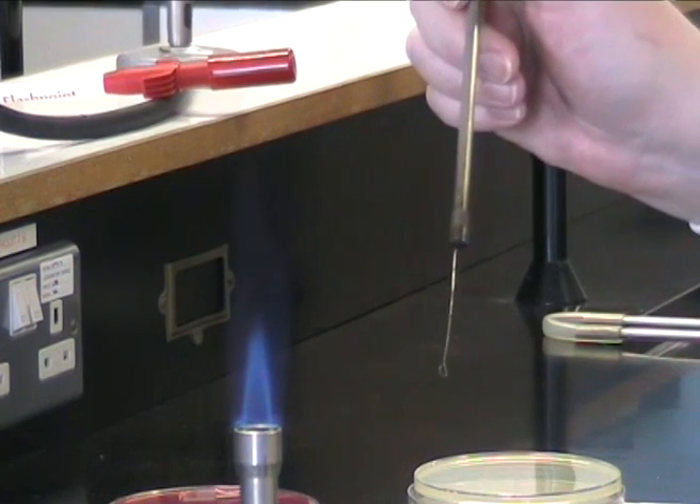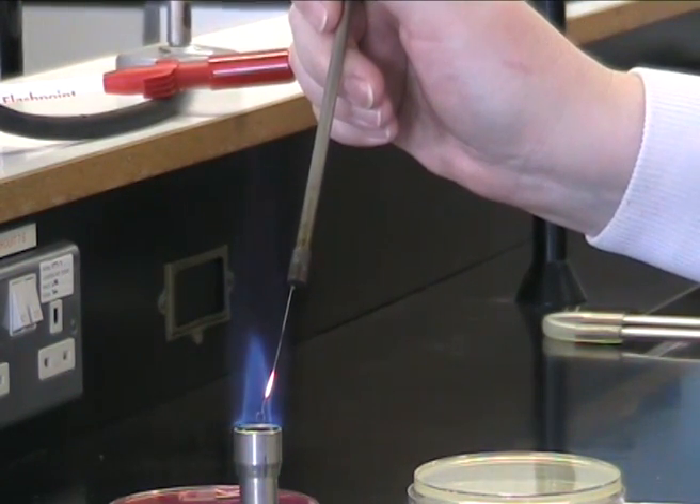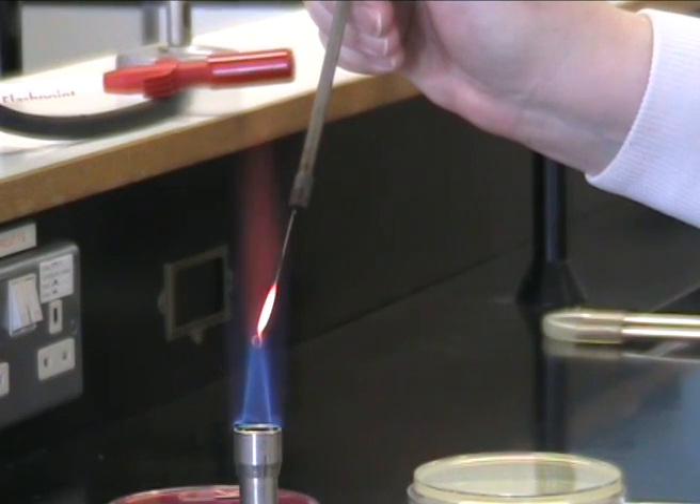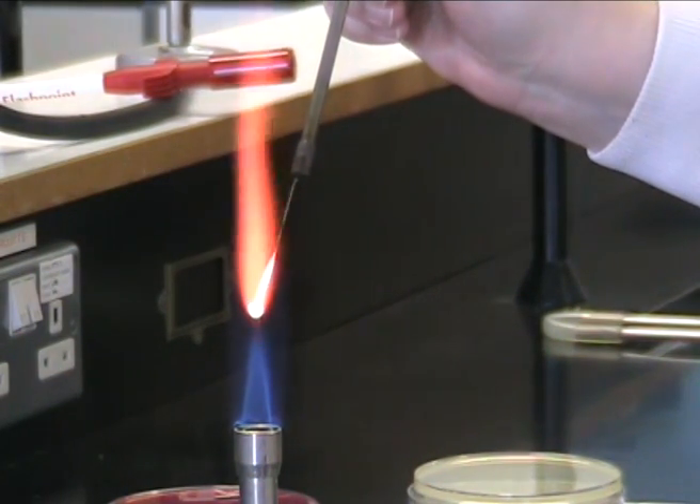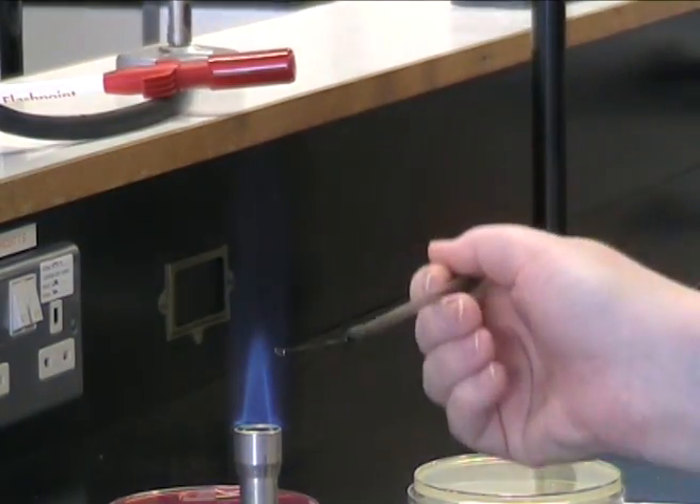First, flame your loop. Put your loop into the cold part of the flame, draw it up to the cone of the flame, make sure it glows red hot — it's now ready for use. But remember not to leave it on the bench.